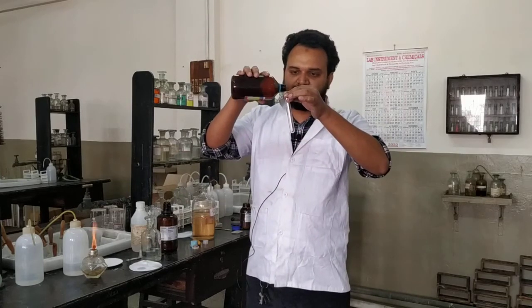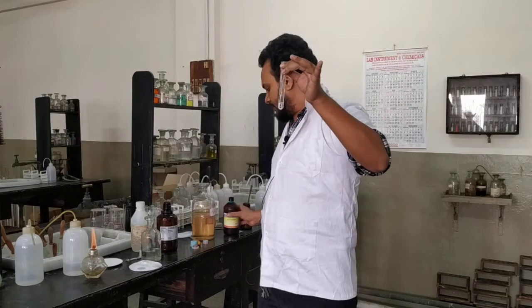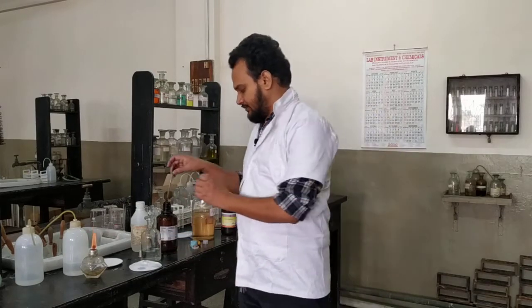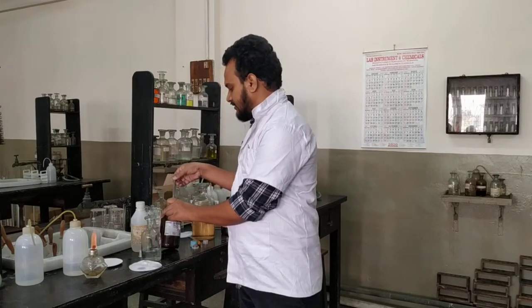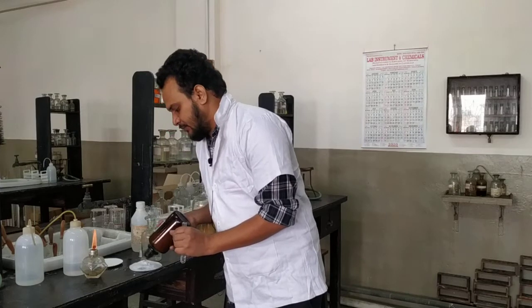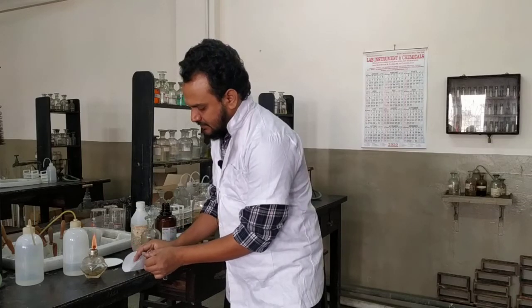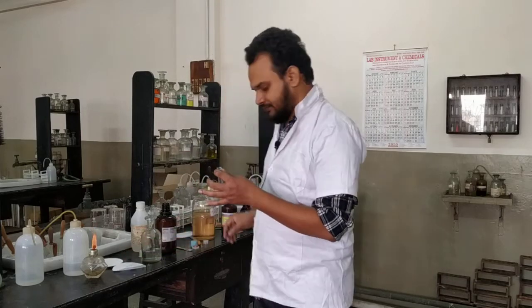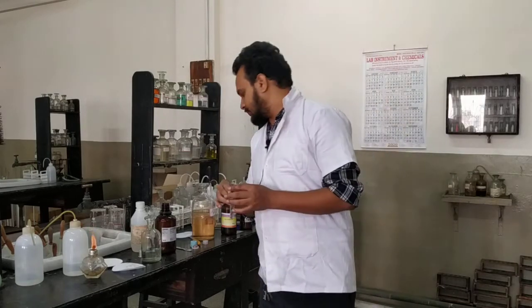First, take 1 ml of glycerol. To it we will add some crystals of phenol. Both are OH compounds, but phenol is aromatic and glycerol is aliphatic. You have to break the phenol crystal using a glass rod if needed. So phenol crystals are added to the glycerol — white transparent crystals.